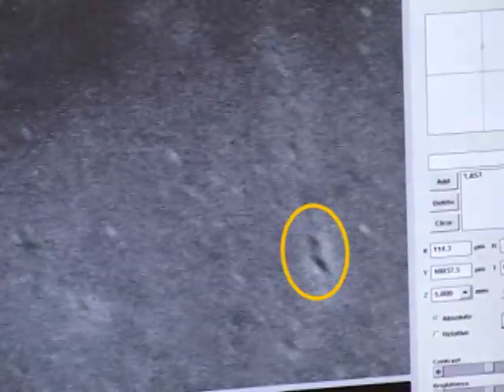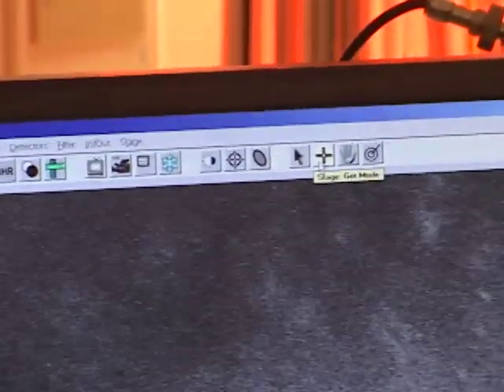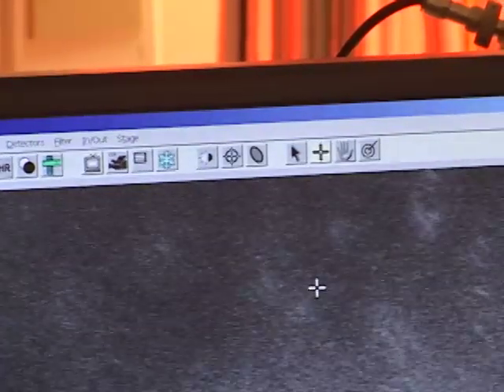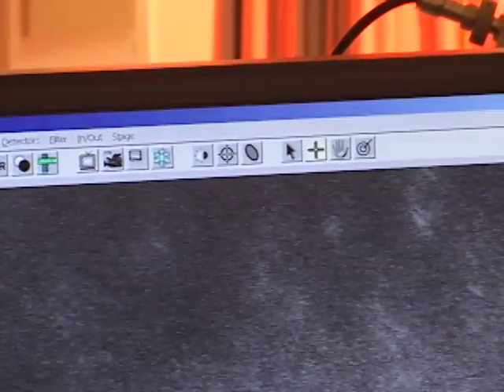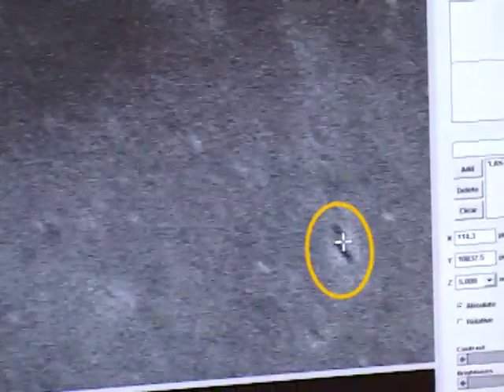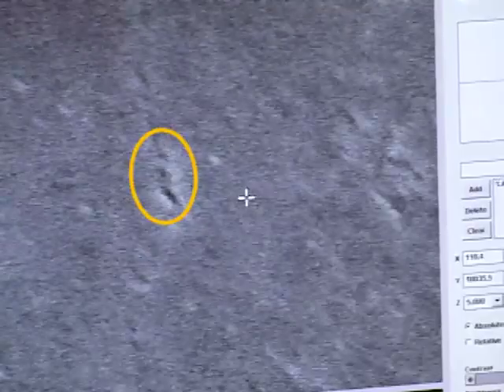I'm going to center this defect on the sample by using one of my stage movement tools. The one that's active right now is the stage get mode — that's the crosshair icon on the mouse. If I want to bring something to the center with the get mode, I just left double click on the feature and it brings it close to the center of my field of view.